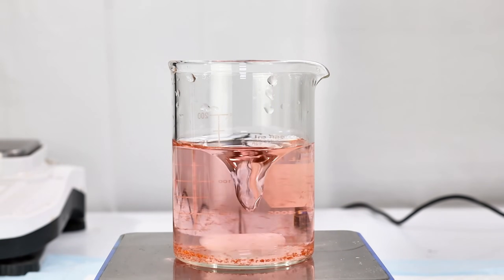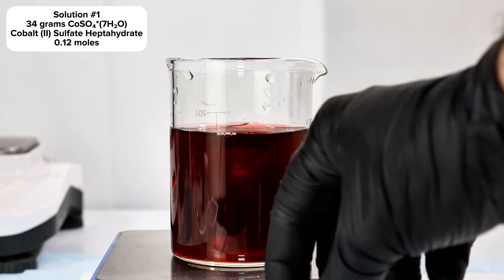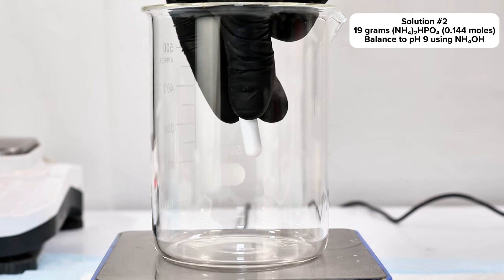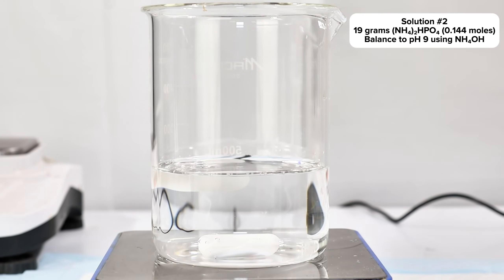To make a standard cobalt violet, I began by dissolving 34 grams of cobalt sulfate heptahydrate in an arbitrary volume of water. In a separate beaker, I then mixed up a dilute solution of alkaline ammonium phosphate. In theory, this could be done by simply dissolving tri-ammonium phosphate directly in water, however in practice tri-basic ammonium phosphate is very unstable and rarely ever sold.